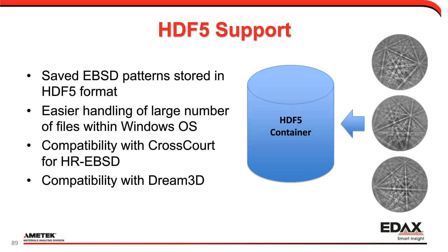And then we talk about saving all these patterns for reindexing, for PRIAS, for NPAR. One of the things we've put in is what we call HDF5 support, which is a file format container that allows for easier handling of these files within Windows and makes it easier to move data around. It's compatible with things like CrossCourt for HR-EBSD. It's compatible with things like DREAM.3D for 3D analysis. So it's sort of an industry-type tool or standard that's being developed that OIM Analysis is compatible with.